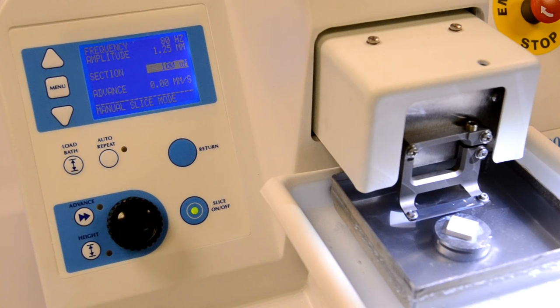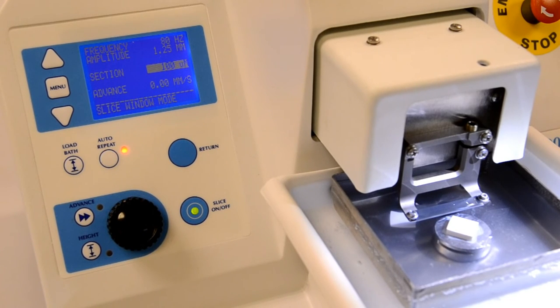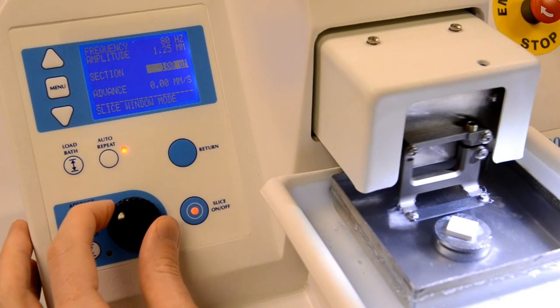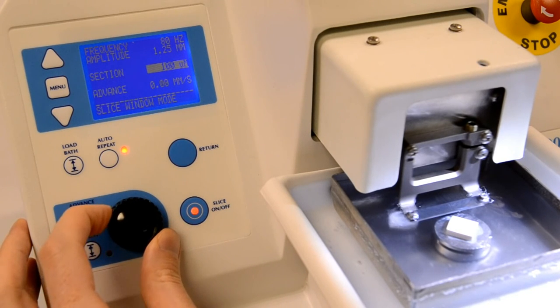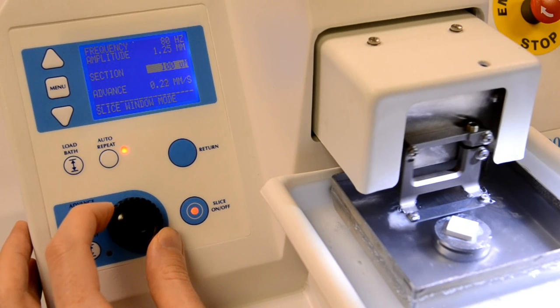In the previous chapter, we showed how to adjust the slicer and take a specimen slice. If you now press the auto-repeat key, the slicer will enter the slice window mode. If you now press the slice on-off key, the slicer will automatically take another cut, remembering where the cut was started and stopped, together with the section thickness you specified.